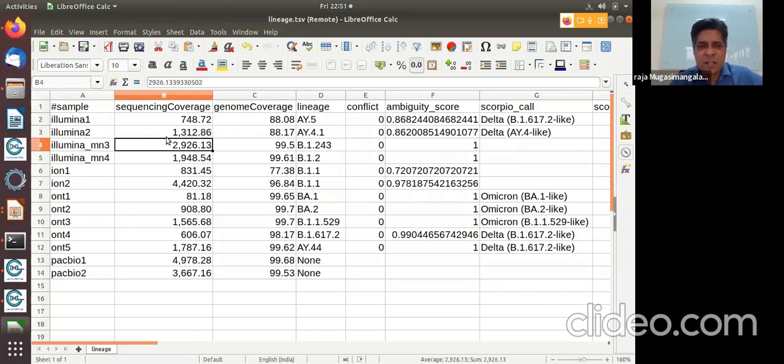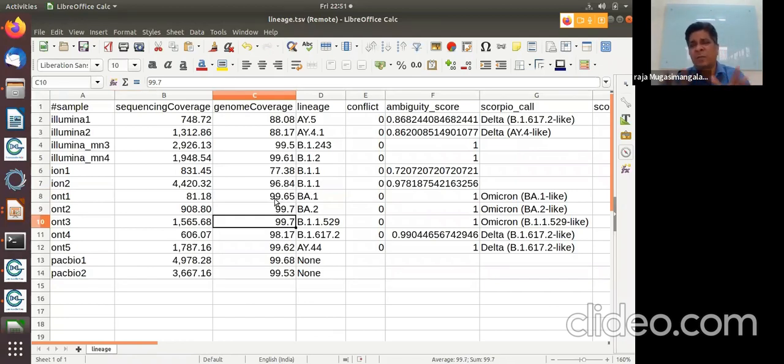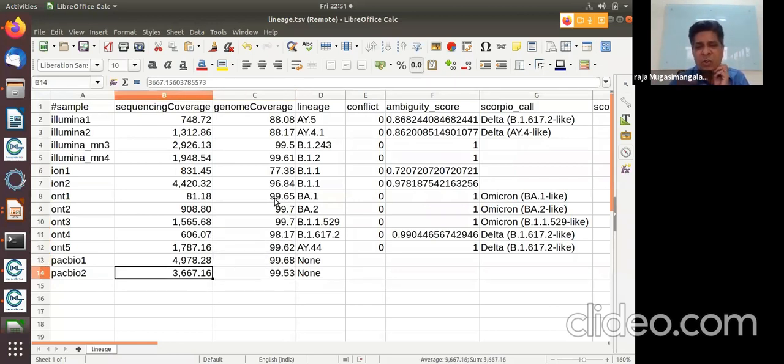And you can see here, this is the MGI data. This is Ion data. These are ONT data. We have seen that typically in ONT, even if I have 50x to 100x coverage, I can cover 99% of the genome. It all depends on the primers. These primers were all optimized by us. We optimized for alpha, beta, gamma, delta, and also after Omicron came, the same set of primers can PCR amplify and sequence everything. And then these are PacBio, right? So you typically need 1000x is high, 100x is low, somewhere in between.